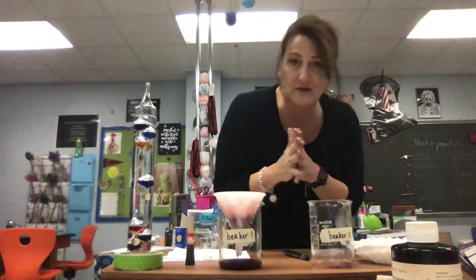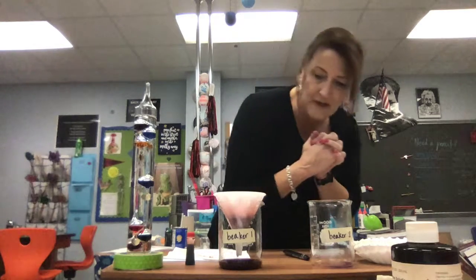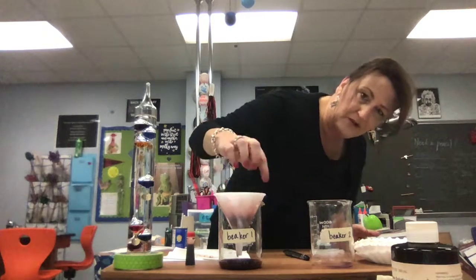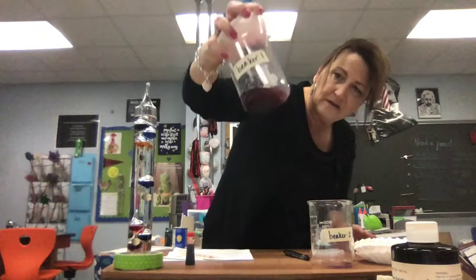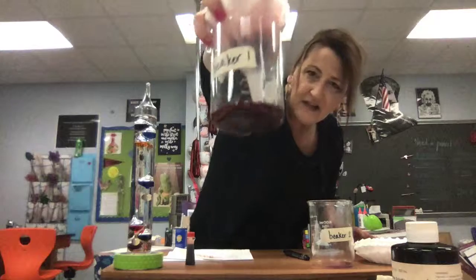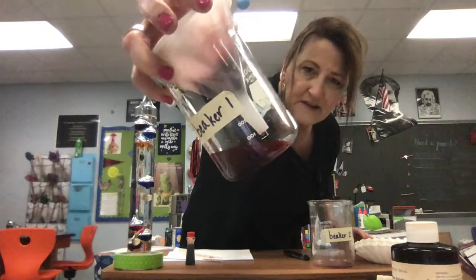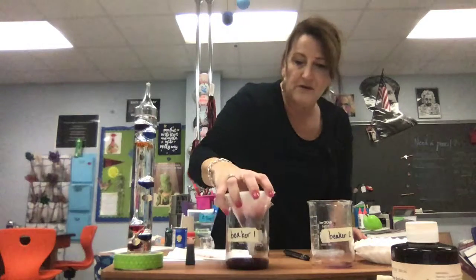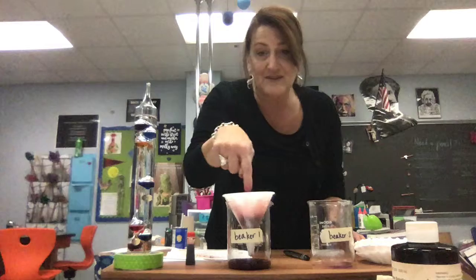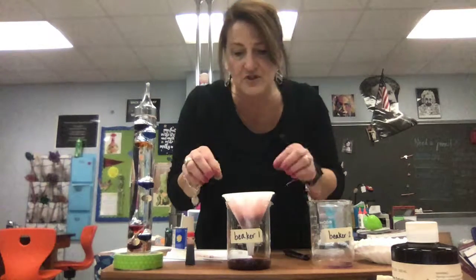So remember, this is a model, so it's not perfect. But again, think about what you think this filter paper represents. And then you can see that this has much more of a red color now, okay, than it did before. It's much less purple. So where do you think the purple is? Well, it's in the filter paper, okay, which I'm going to show you once it finishes filtering.